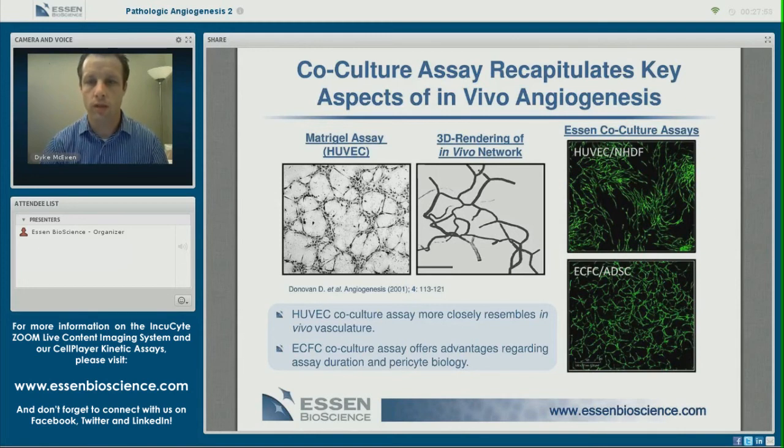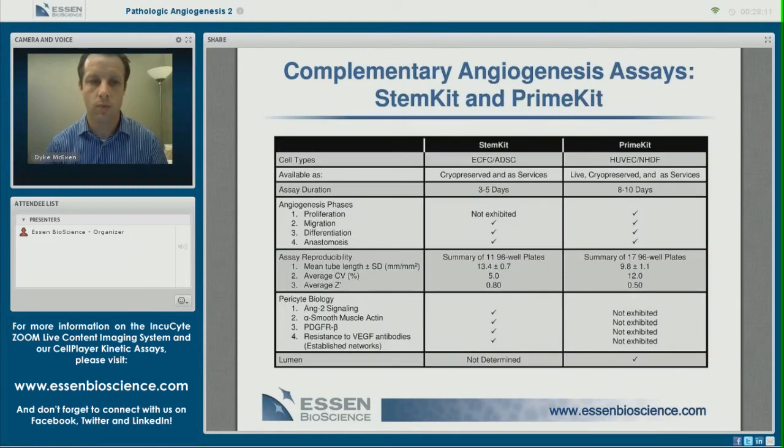Furthermore, when we looked at the pharmacology of both the prime kit and STEM kit, the pharmacology of these assays correlates very nicely with published and developing in vivo pharmacology, and I'll get into some of that toward the end of the webinar.